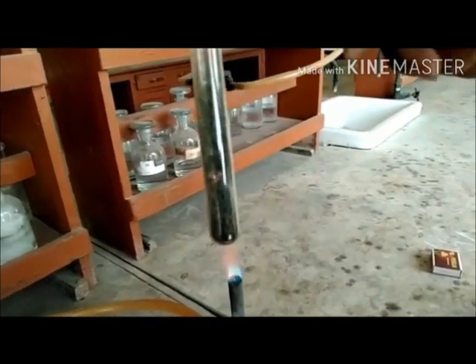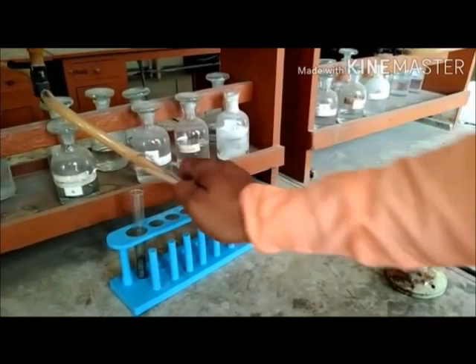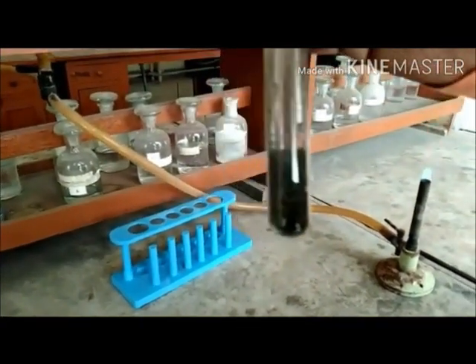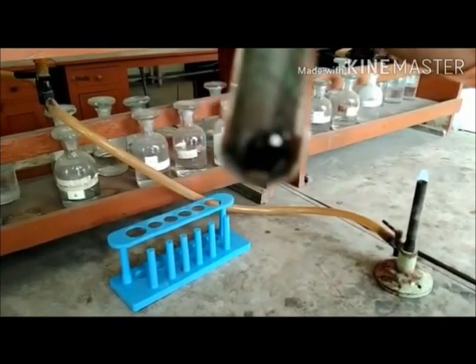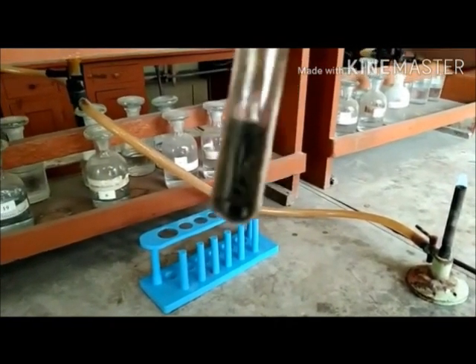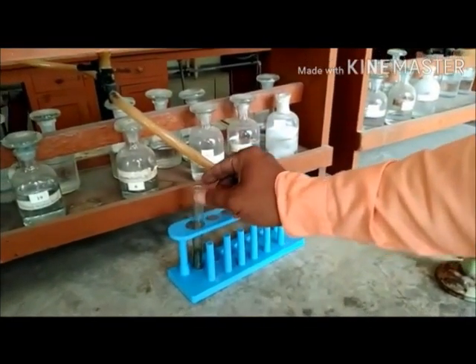The fumes that are produced condense on the walls of the test tube in the form of small water droplets. The greenish substance left behind is chromium oxide. We have obtained a greenish residue that is chromium oxide, and we can observe some water droplets on the walls of the test tube. The colorless and odorless gas produced in this experiment is nitrogen gas.